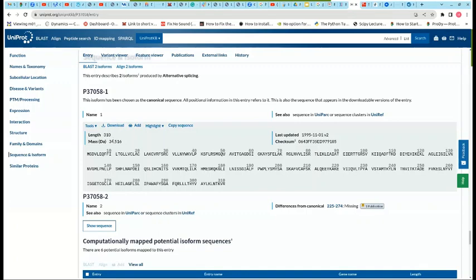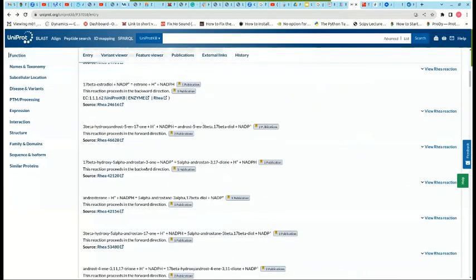So if we're on this page, let's click on download. We want to get the FASTA sequence. Are we all on this page? Well, someone said the structure is not showing. It could be network. But just don't worry about the structure. Go back to download. We are not interested in the structure now.